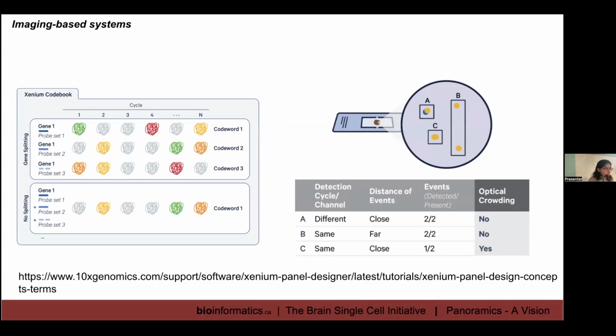Because the whole point is, just like, how many of you do imaging? How many of you know the pain of optimizing and diluting your antibodies so that it doesn't saturate? Yeah. So the thing is, this is fluorescence emission. It's light. Light can be blinding, and light doesn't just blind our eyes. It also can blind the optics of your microscope.